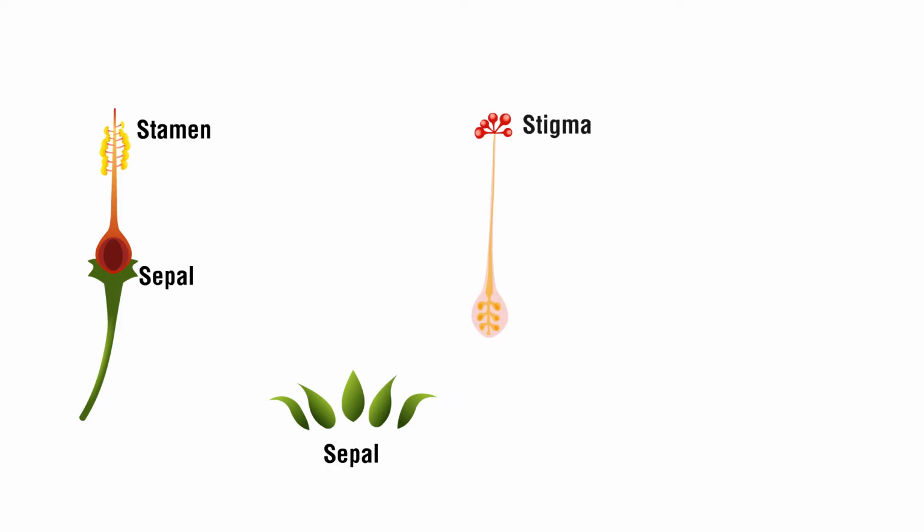Using the same, take out the stigma along with style from the carpel. Pull out the individual parts with the help of forceps and needle, one after another. Observe and label each part of the flower carefully. Observation: we will observe different parts of the flower, which includes both the male part and female part. Let's go through a detailed study.